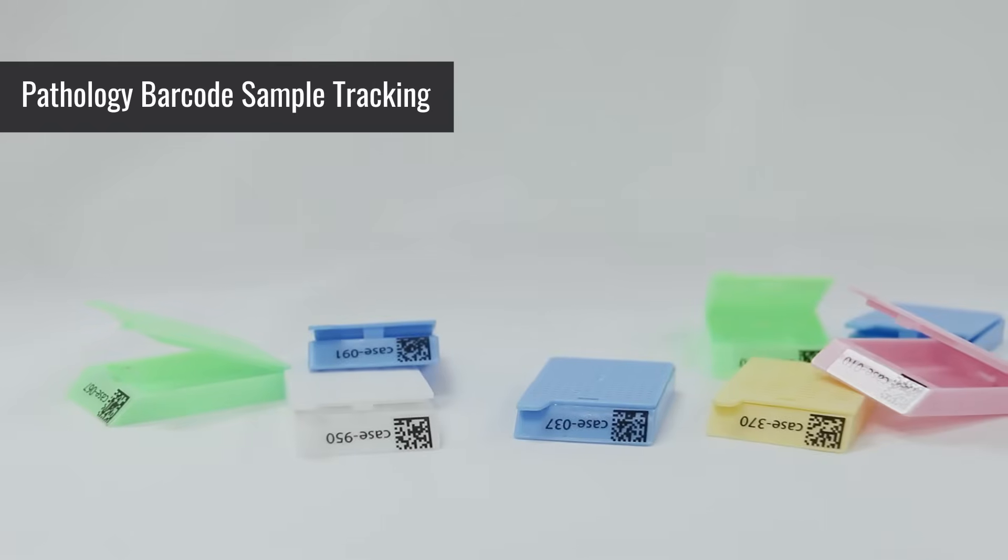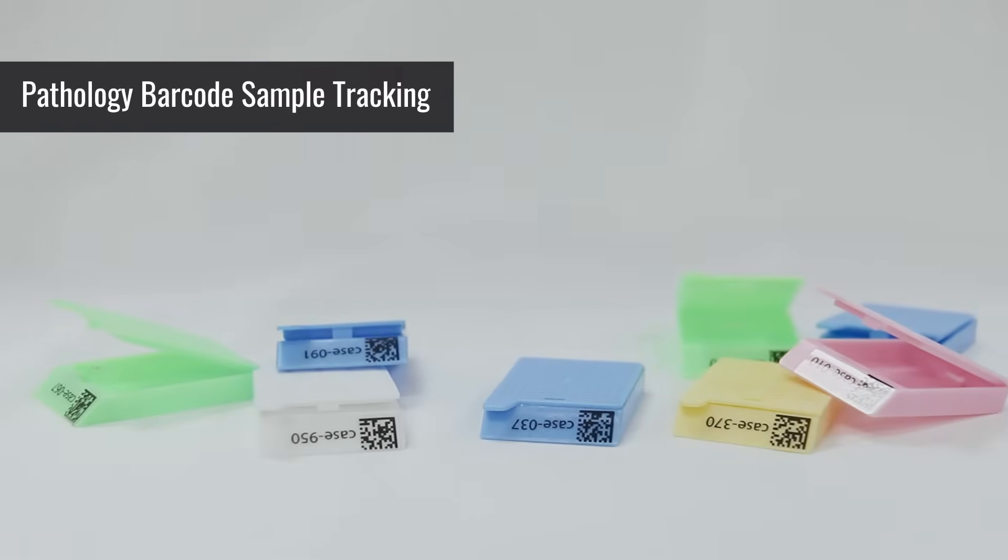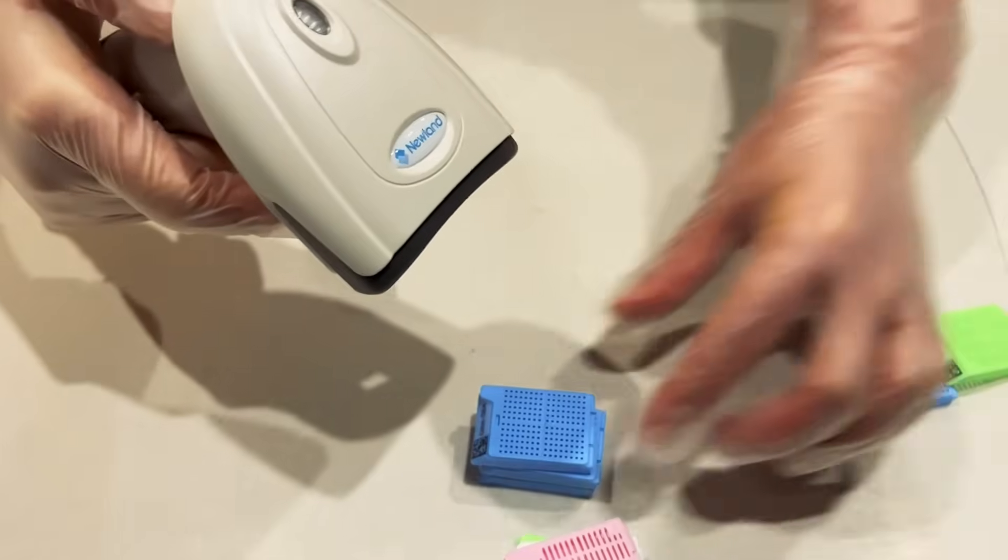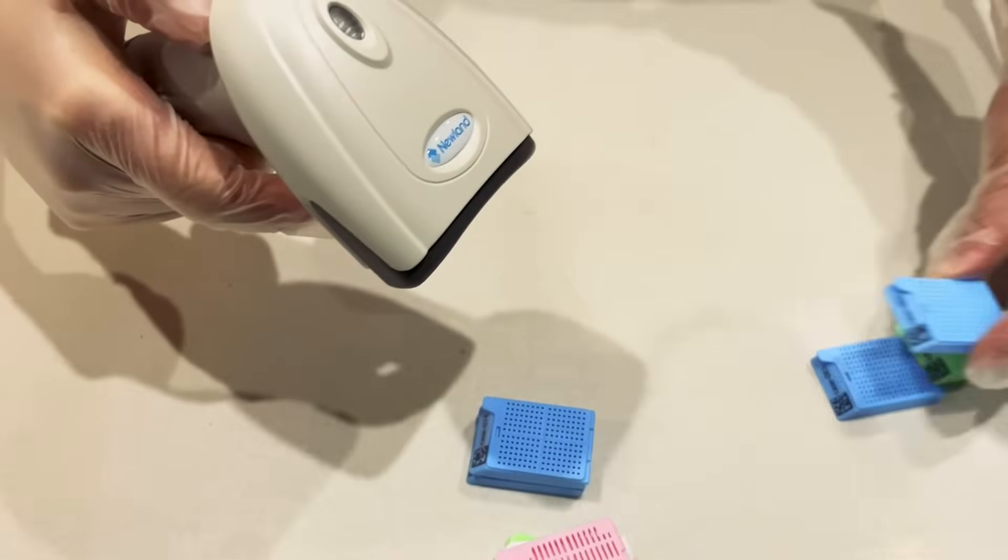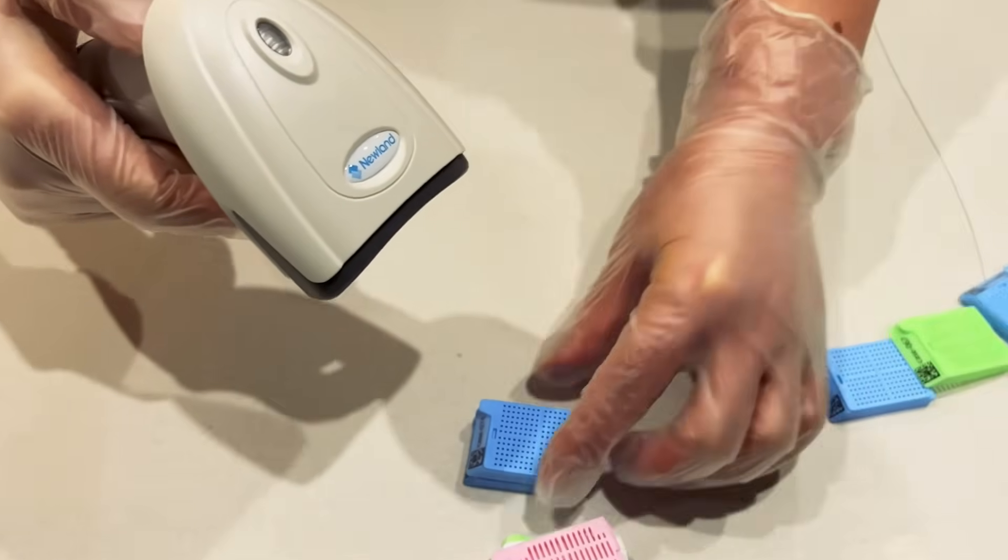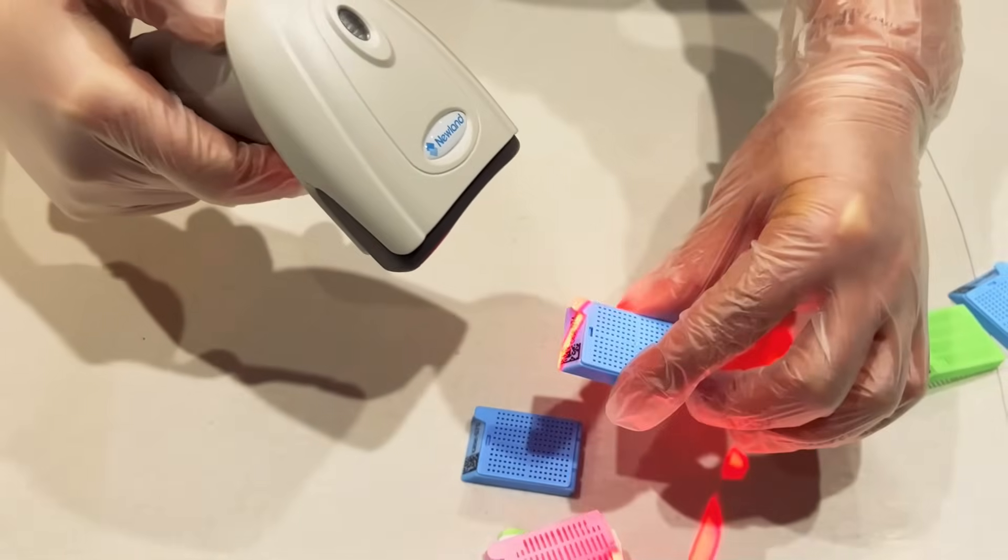Cassette scanning is essential in pathology labs, but traditional methods require scanning one-by-one, slow and prone to errors.